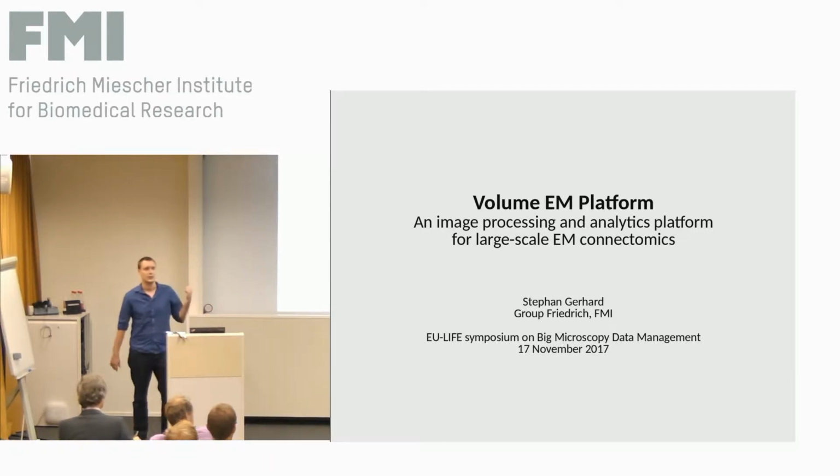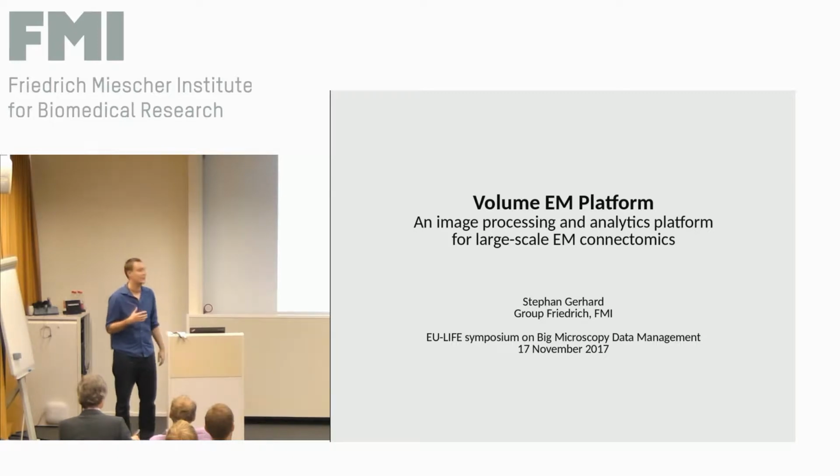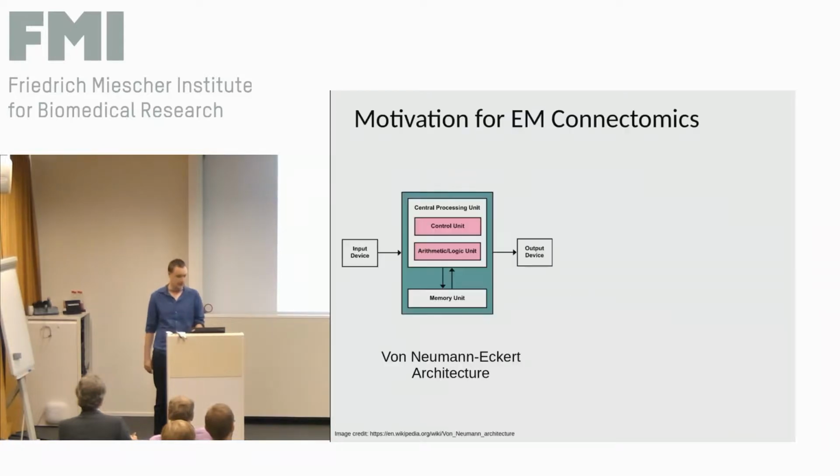There's a slight change in title. The brain circuits I/O is replaced by volume EM platform because all these developments are quite recent, and also the thinking process on what actually the software stack that I'm going to present is. So volume EM is an image processing and analytics platform for large-scale electron microscopy connectomics.